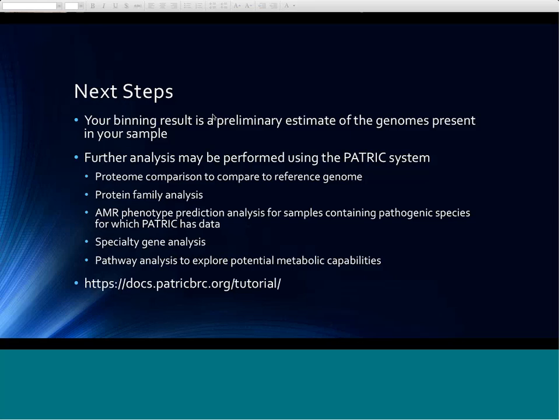We just have been spending a lot of time on the quality analysis and integration of our tool currently. But if folks have favorite binning tools that they like, and ideally, if they've got samples that they know bin well with other tools, we'd be very interested in what you think of our binning service, and particularly if there are samples that you can give us or references to samples in the public archives that we can use as test data.